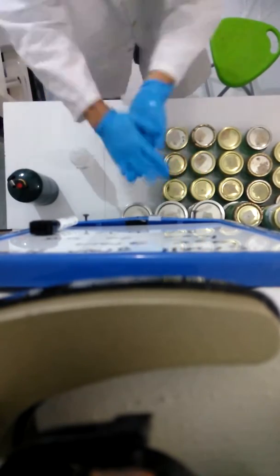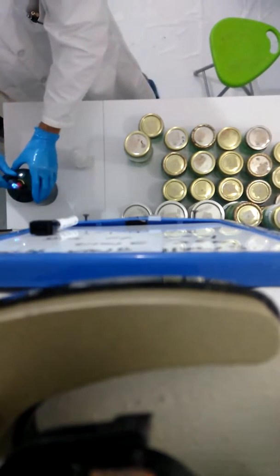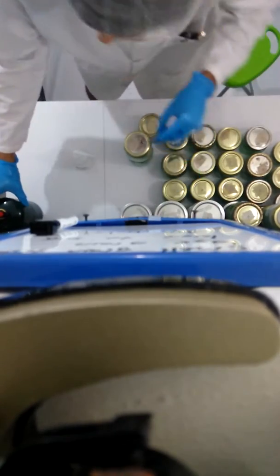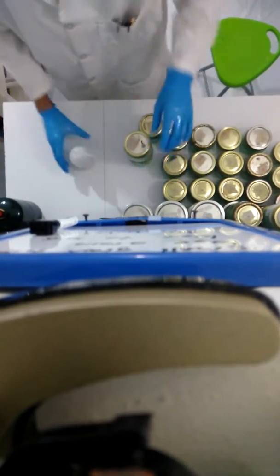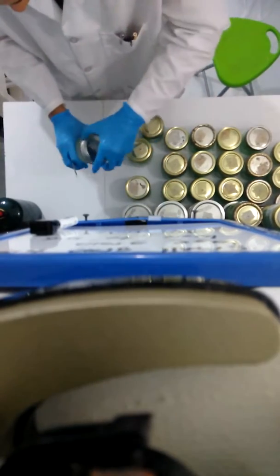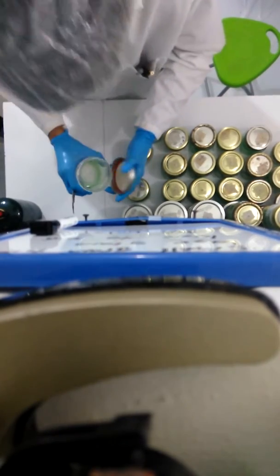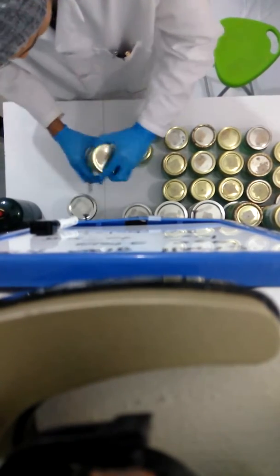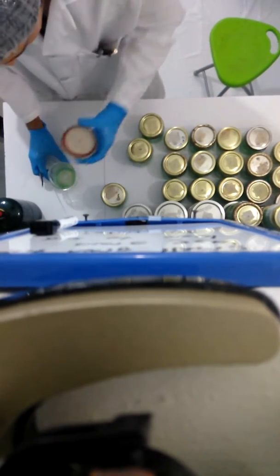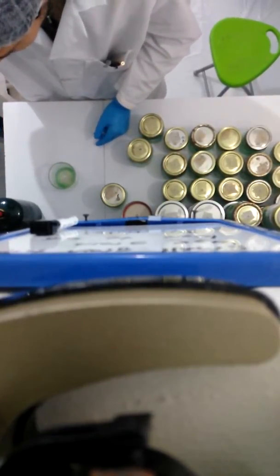Alcohol always gets applied. Alright, torch goes on, we'll start down some, super high. Then we'll move in. That is a clean blue oyster plate. Pop my lid opener, find the scalpel.